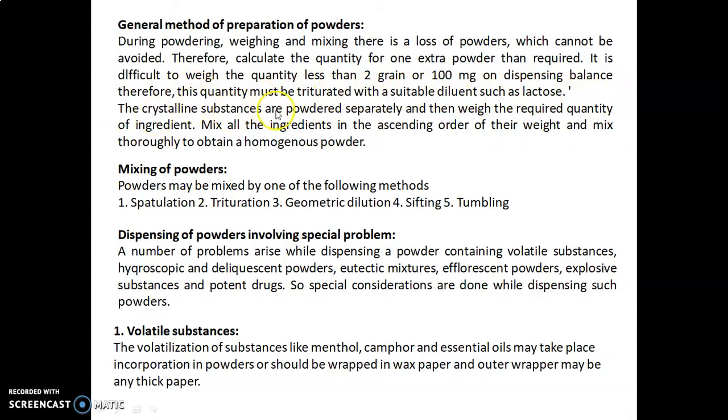The crystalline substances are powdered separately and then the required quantity of ingredient is weighed. Mix all the ingredients in the ascending order of their weight and mix thoroughly to obtain a homogeneous powder.